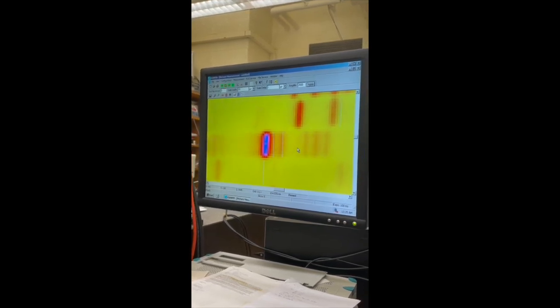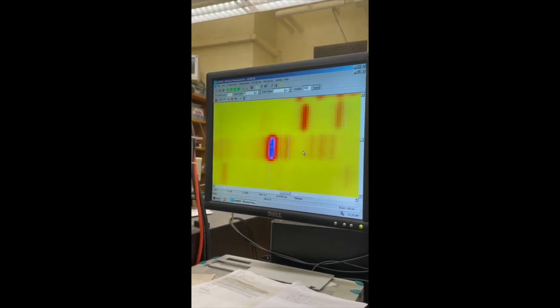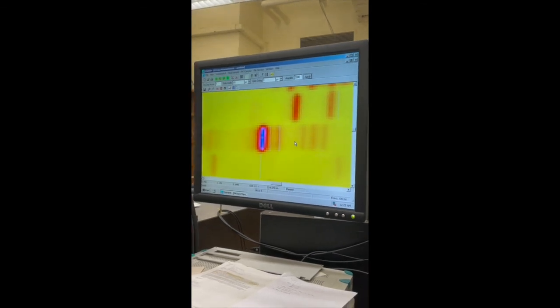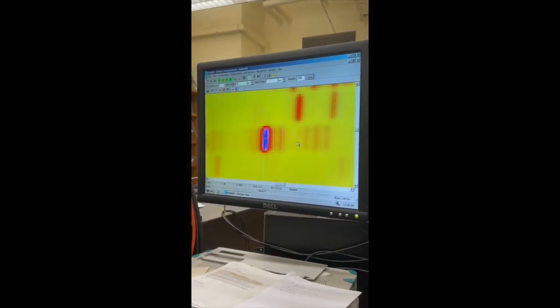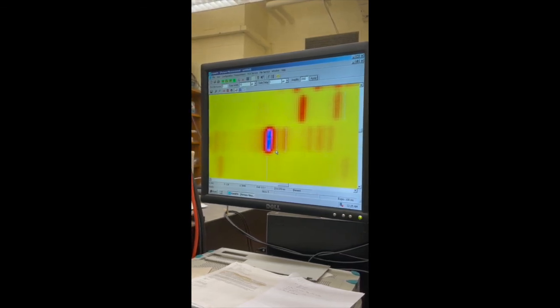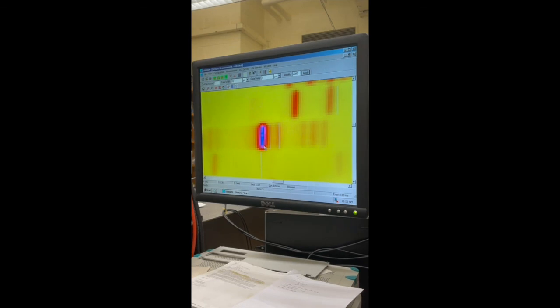And then this will tell you, do you want to move left or right? 1 pixel, 2 pixels, a half pixel is allowed. But it's those little box pixels on the screen that tell you how much to shift it. So you really do have to zoom in to this level to see them. And that looks exactly centered as you said. Right. So it looks really good.